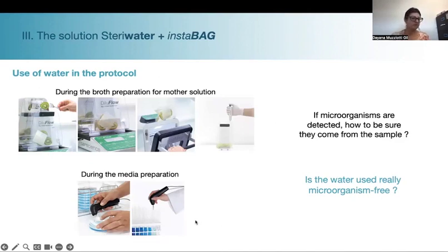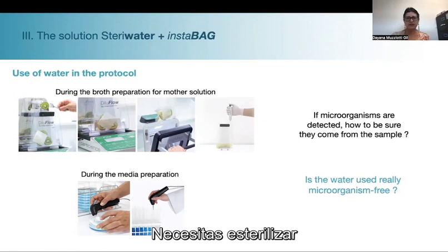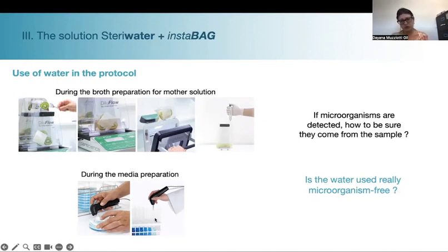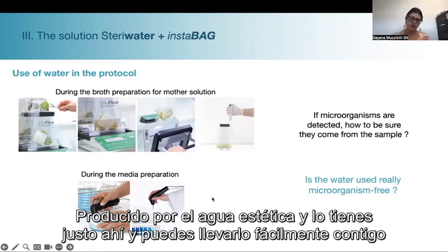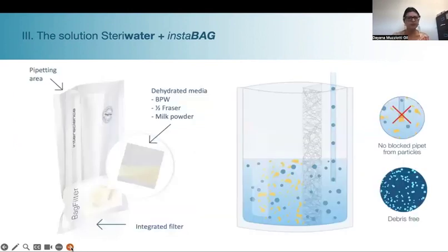And even if, for example, sometimes in molecular biology, you need sterile water. So you can also prepare aliquots of the sterile grade purified water produced by the sterile water, and you have right there, and you can easily take it with you when you are working on your analysis, on your experiments.